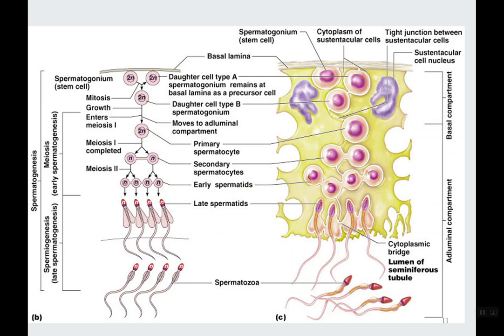Okay. Now, first let's address what this yellow stuff is. So this is the cytoplasm of sustentacular cells. And sustentacular cells are really, really big sheet-like cells, and the developing sperm are kind of nestled between them, like between the pages of a book. And it provides a safe, nourishing environment for the spermatogonia to differentiate into spermatids.